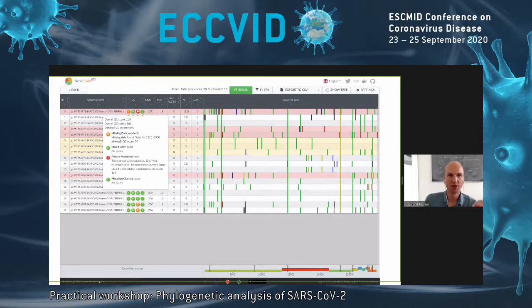One thing where this sequence actually came out not necessarily bad, but at least something to take a close look at: it has a lot of mutations that we don't see in the reference tree. That is, a lot of mutations that seem private to this particular sequence, which is often a sign that you want to have a closer look, whether these mutations are real, or whether there's some sort of sequence assembly, sequence chemistry, or sequencing artifact that might generate spurious signal in this sequence.